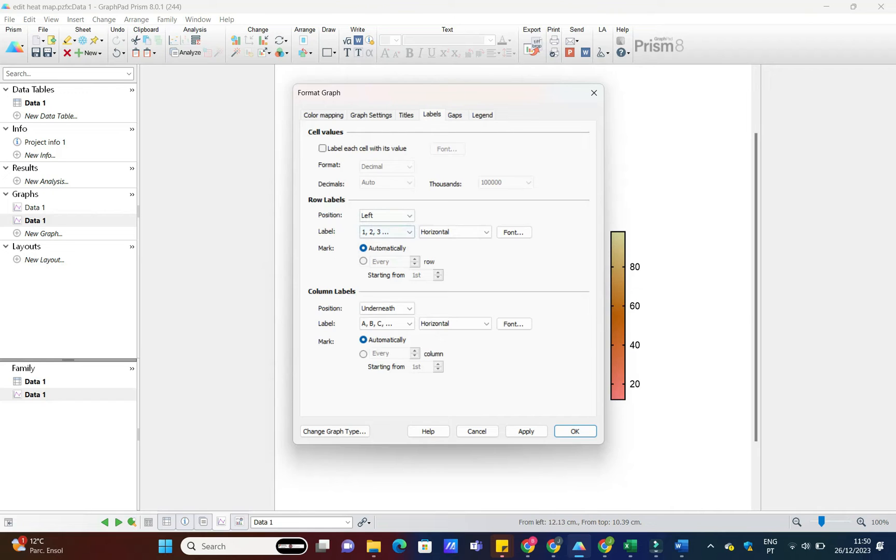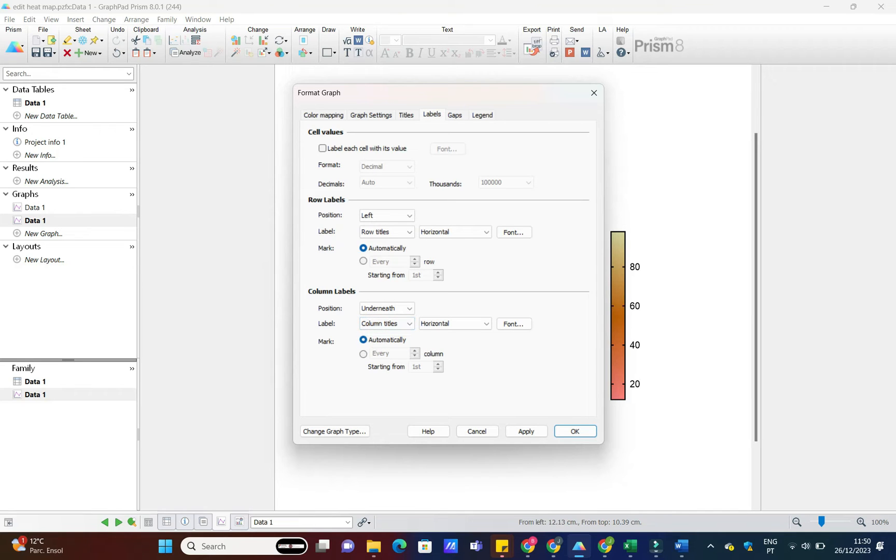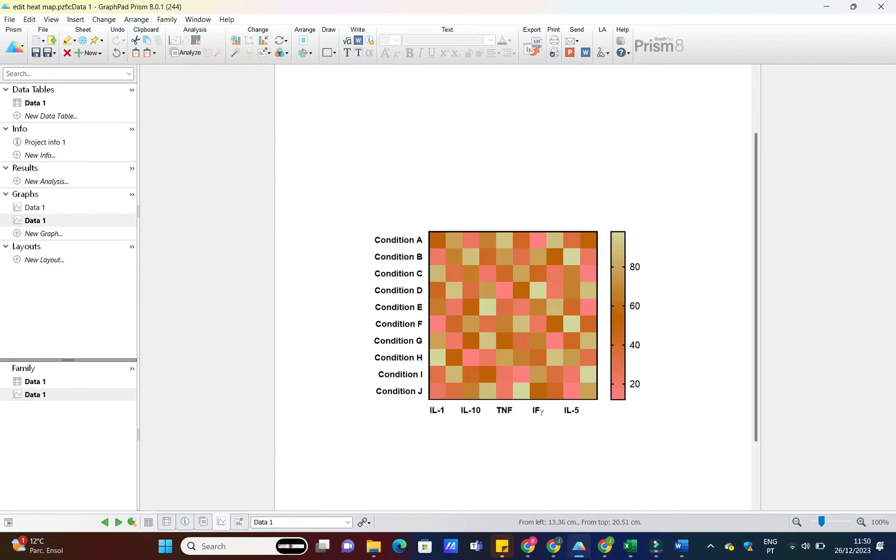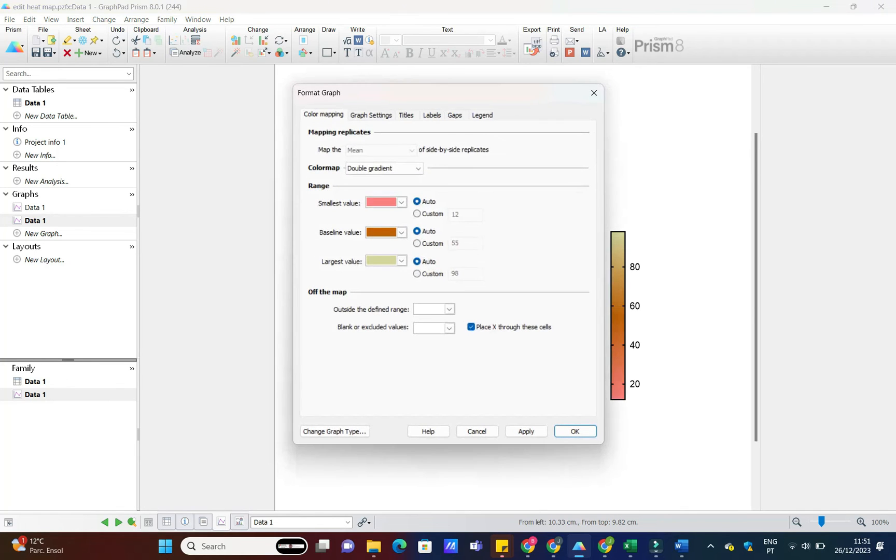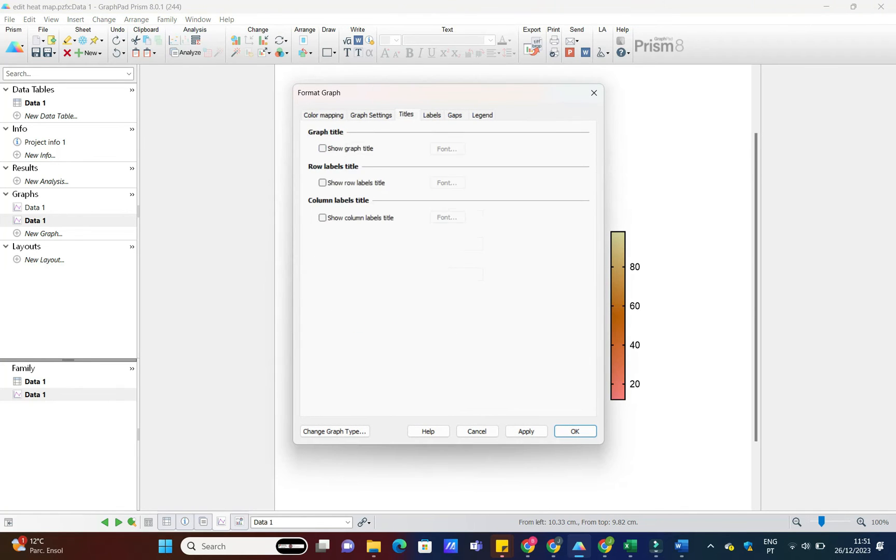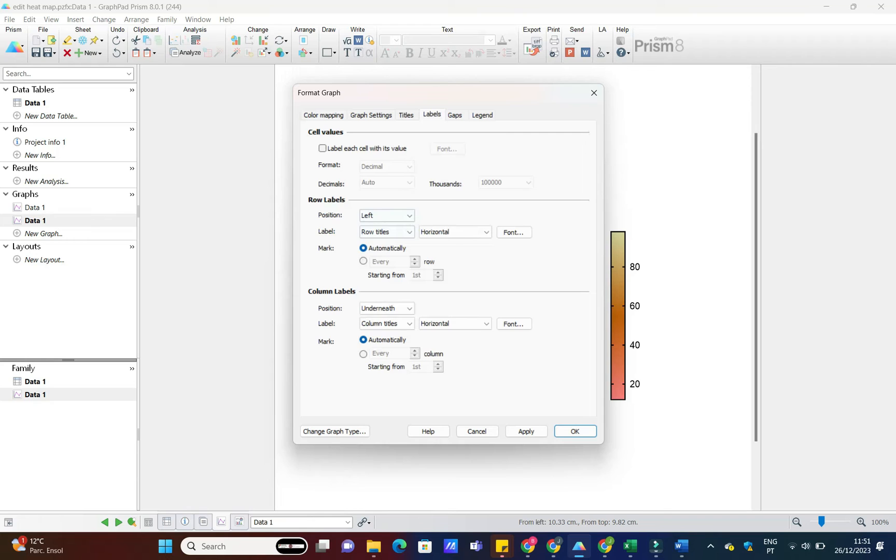Annotations and legends can provide additional context to your heatmap. Use the Annotate tool to highlight specific regions or add notes. And of course, a well-designed legend is a must. Let's make our heatmap tell a story.